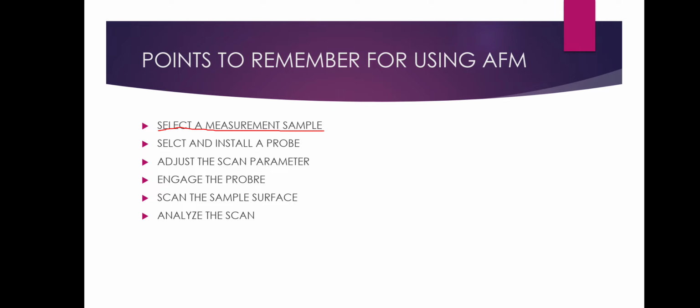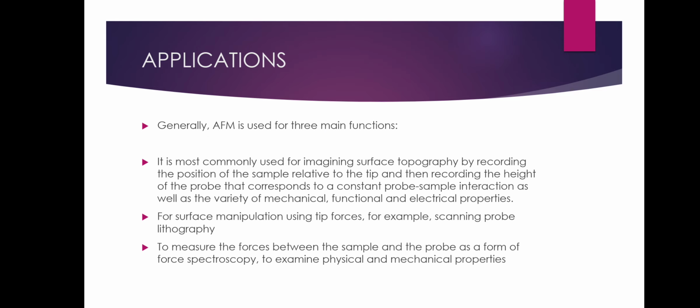An experienced AFM user must learn to interpret the AFM image correctly, to understand the tip sample configuration and to distinguish common measurement artifacts. So those are some points to remember for using an AFM.